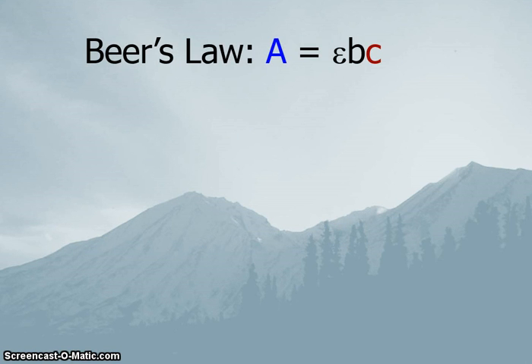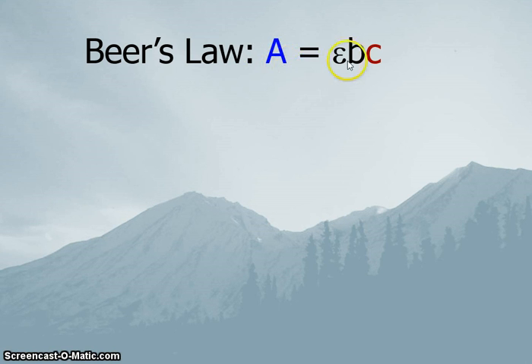Today, in this lab, we're going to exploit what is known as Beer's Law, which relates the absorbance of a colored solution by two constants: molar absorptivity, path length, and concentration.